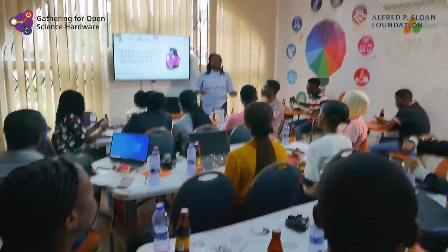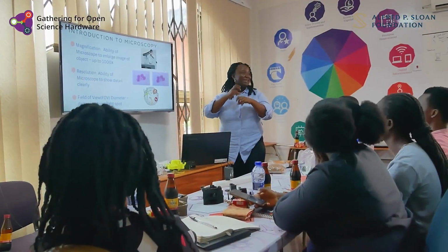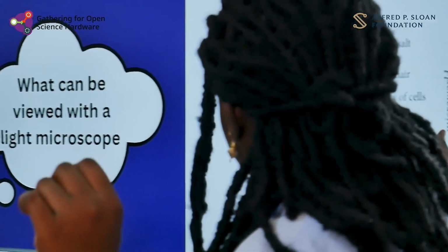We are going to kind of start from the scratch so that everybody gets the concept.